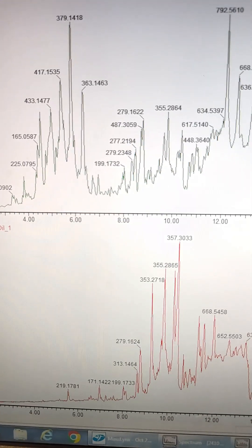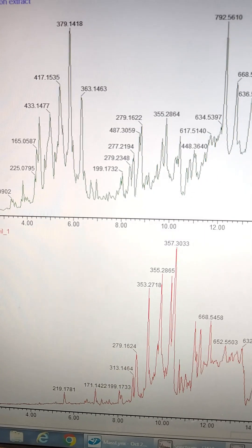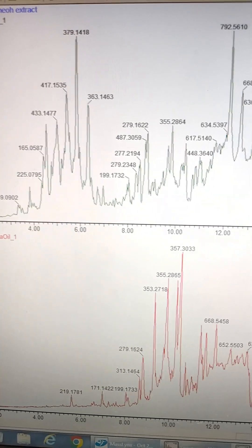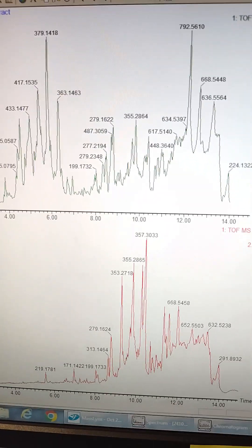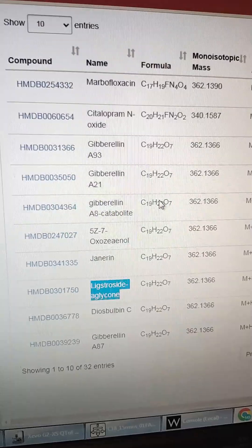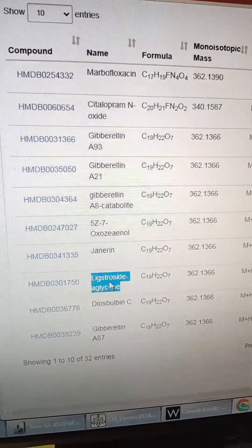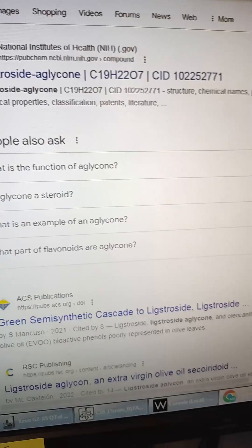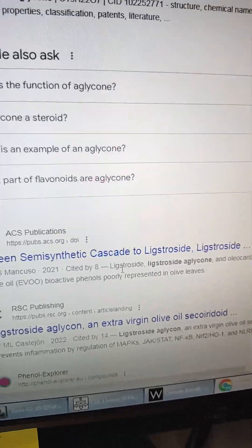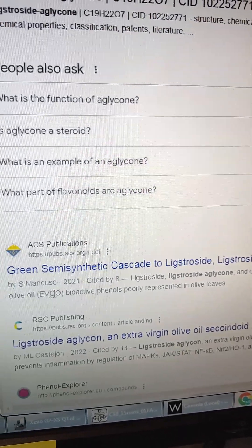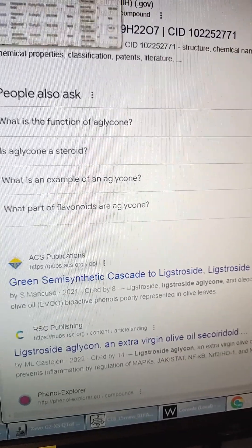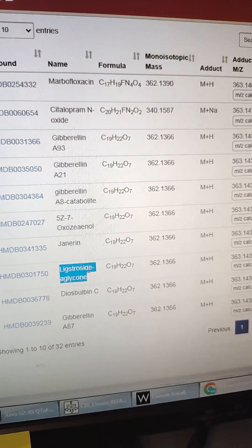So we're just using HMDB. And we're not looking at a lot of MS-MS data. Since there's so many peaks, we're going to have to put this through Cirrus. Let Untargeted 2 have at this. Maybe in the next few days I'll have a big list. And then we can do kind of a deep dive into all the different things we found. But there is way more in there than I was thinking there would be. First hit, 363. This is the olive oil. I'm liking this ligustroside aglycon. When you search this molecule, it does seem to be an extra virgin olive oil bioactive polyphenol. So that is actually tracking right to olive oil. I think that probably confirms that this is olive oil.